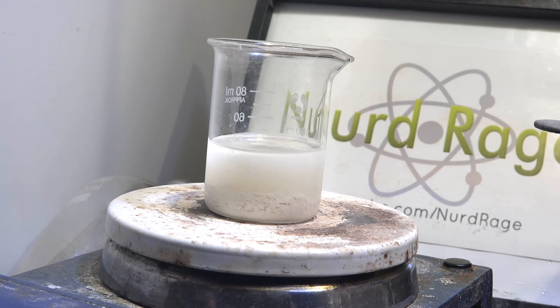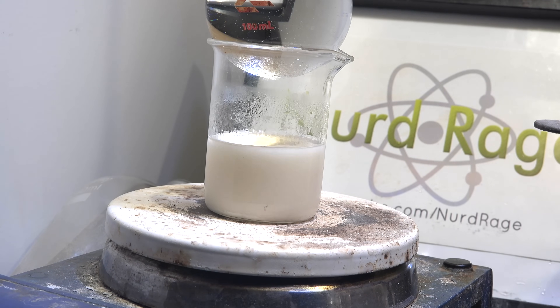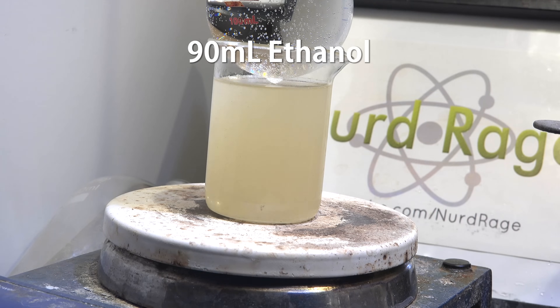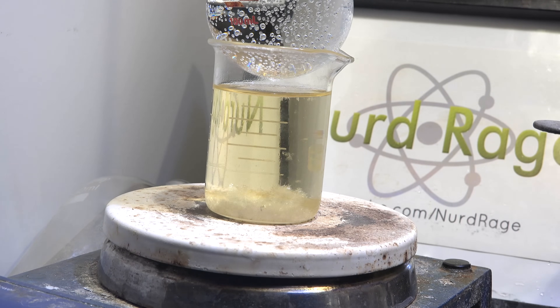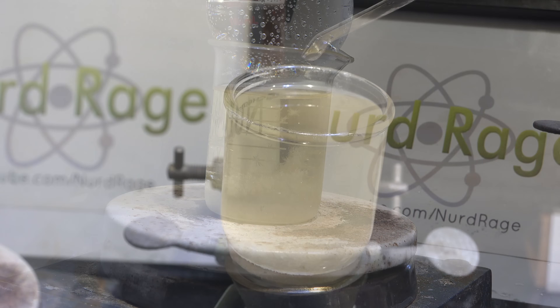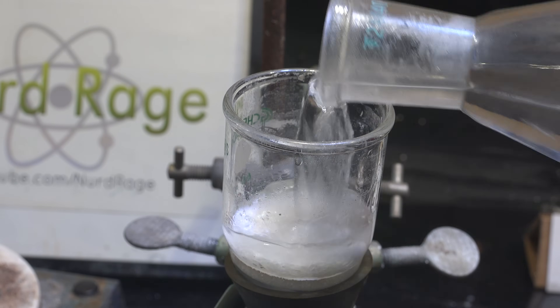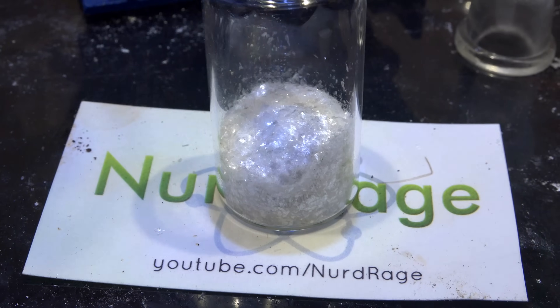To purify further, we crystallize from ethanol. Place on gentle heating and add ethanol while boiling until it dissolves — I needed about 90mL to fully dissolve the pyrimethamine. Once dissolved, turn off the heating and let it crystallize back out. Most of it will remain dissolved in the ethanol, but what we get will be exceptionally pure. Filter the crystals, wash with ethanol and then with diethyl ether, and leave under a vacuum stream to dry.